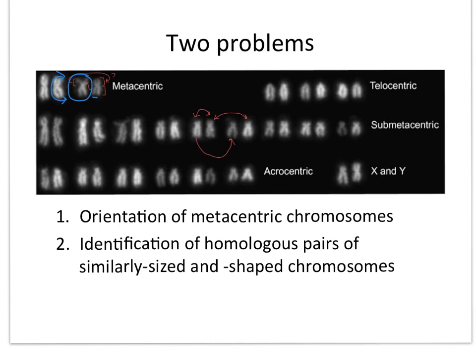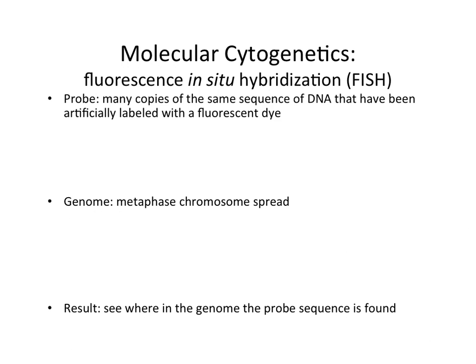Fortunately, we have a technique that we can use to deal with these problems. And this is a technique called fluorescence in situ hybridization, which is the acronym FISH.